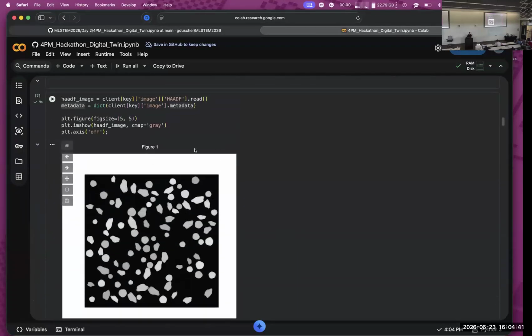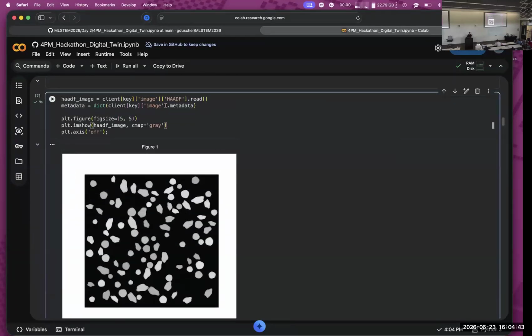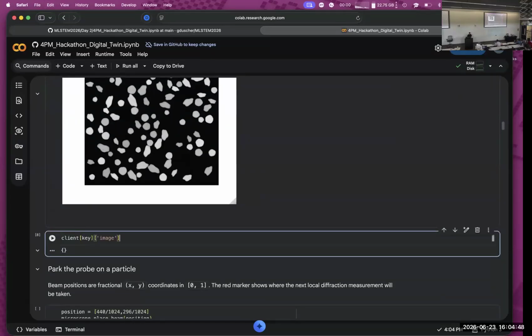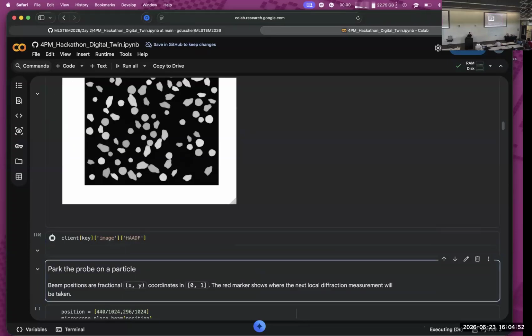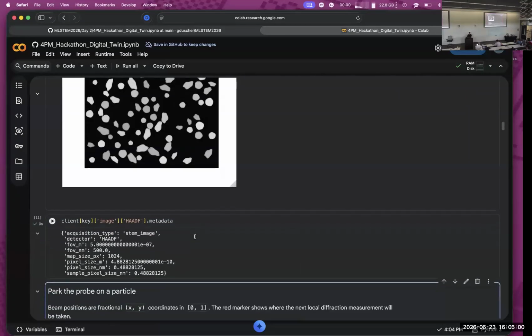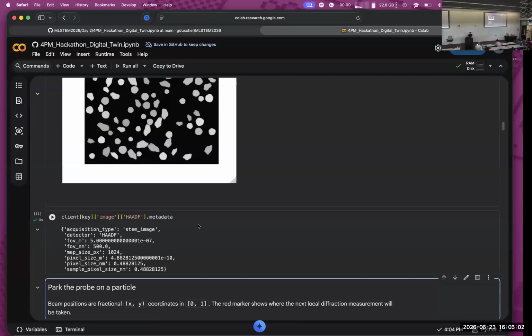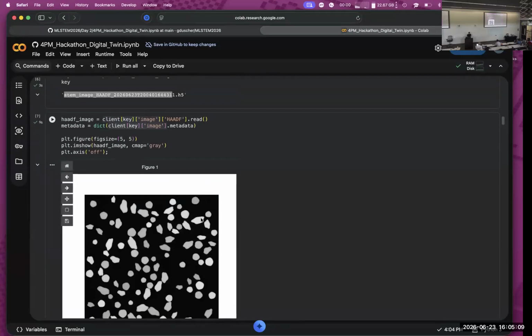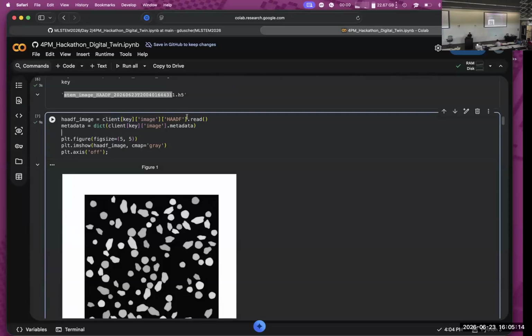Well, that's not too good. Oh, I see the issue.